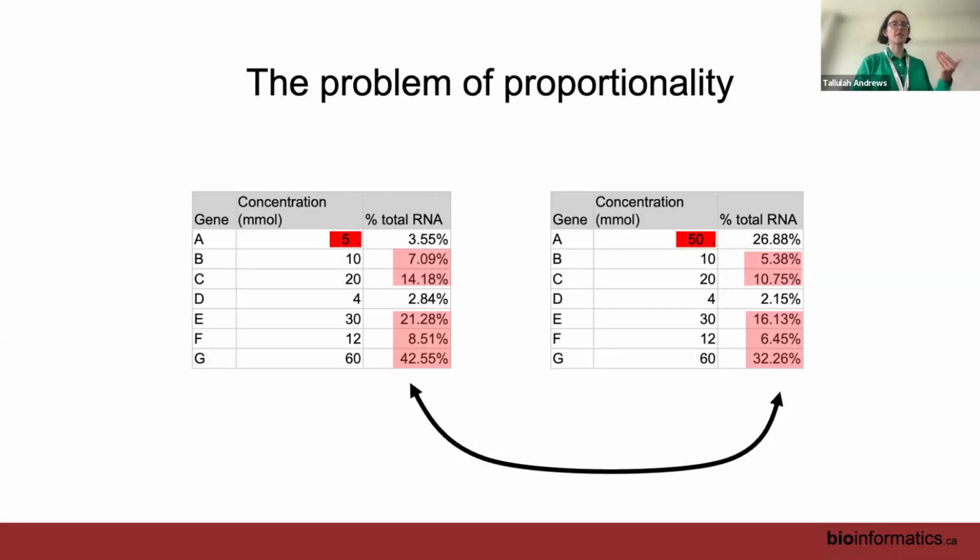Their percentage of the total RNA has gone down, even though the actual expression level hasn't changed. It's just that one of the genes has changed a lot.